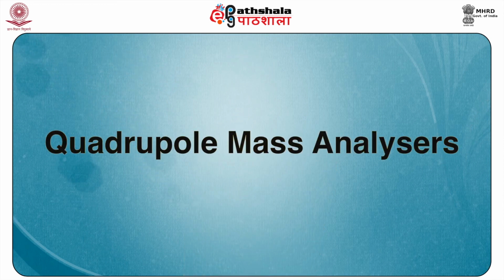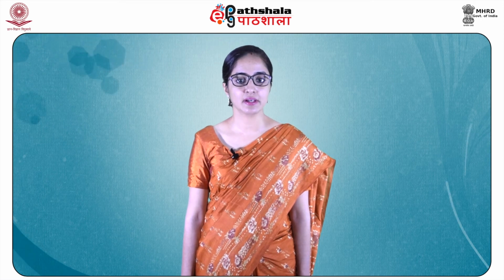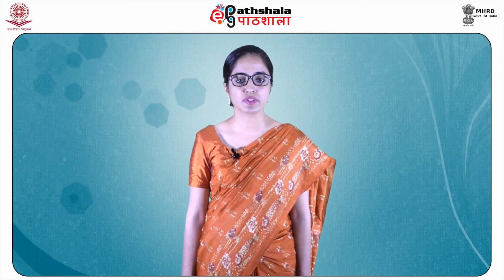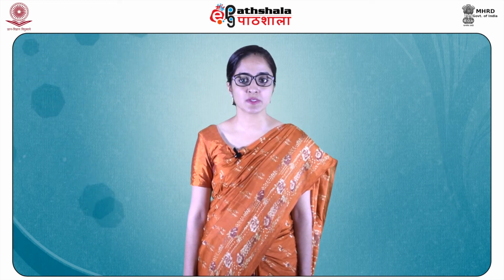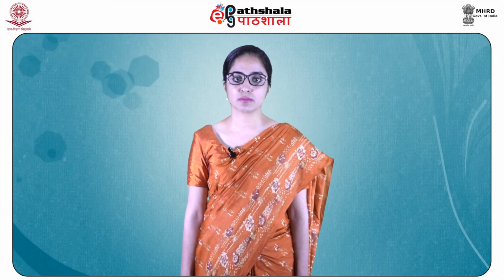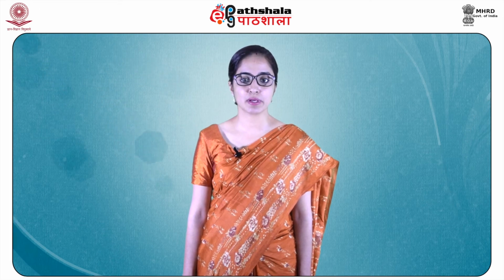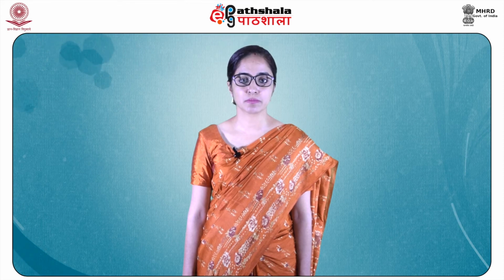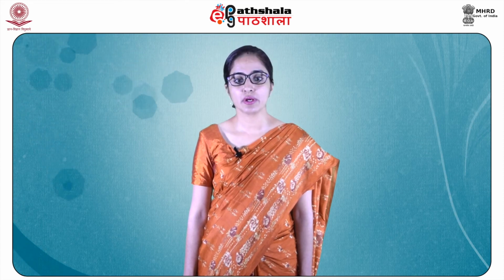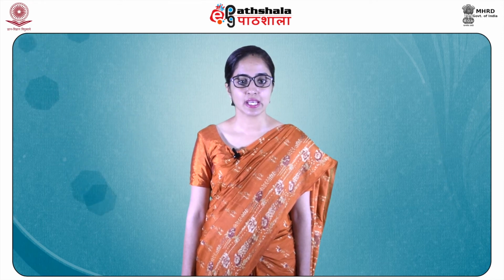Next, we come to the quadrupole mass analyzers. A quadrupole mass analyzer has typically a range of 0 to 1000 m/z values and the corresponding spectrometers are low resolution instruments, that is R is approximately 3000, which are incapable of providing exact elemental composition of the sample. It works on a similar principle as the linear quadrupole. Now, you can see here how this quadrupole mass analyzer looks in this figure.